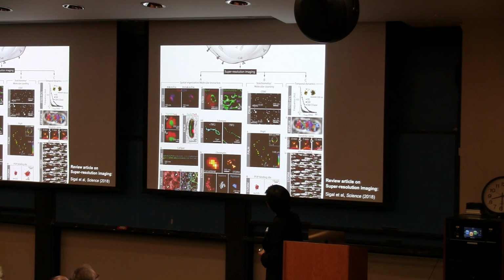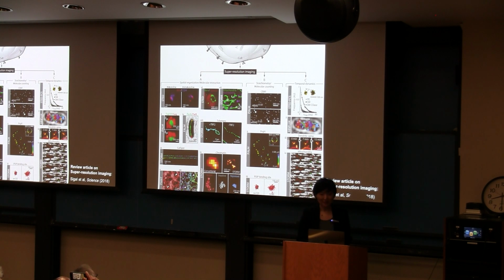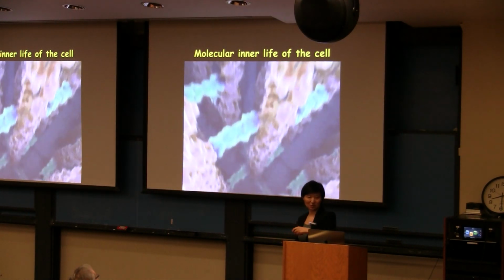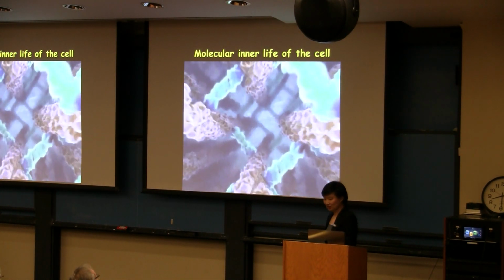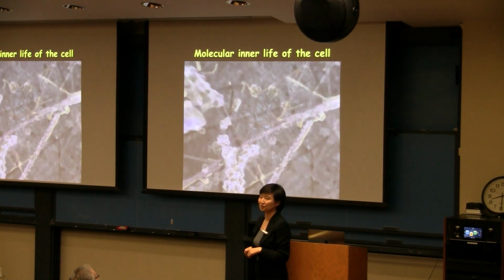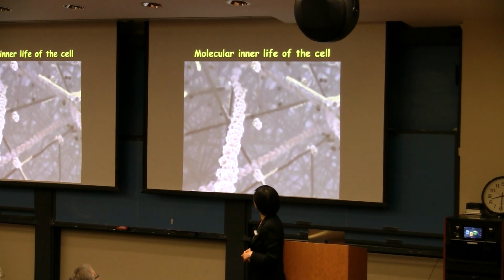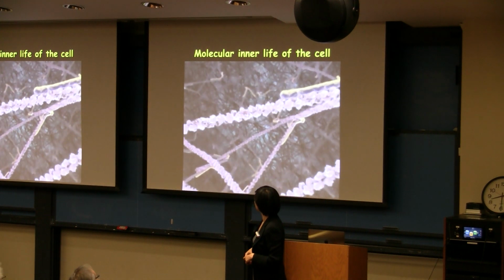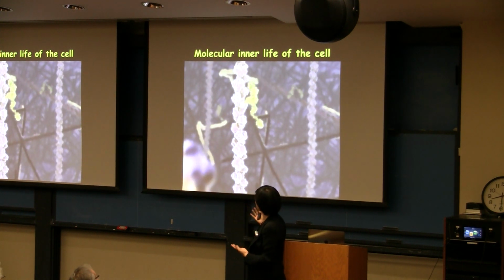Here, I have a beautiful parade structure in this picture. So with that, it's really beginning to give us a much better, clearer, and more detailed picture of what's inside the cell, the molecules and their interaction networks. And the hope is with the development of imaging methods with a higher resolution, but not only higher spatial resolution, but also higher temporal resolution. And then eventually we would be able to see the molecular events unraveling right in front of our eyes, just like this kind of a movie.